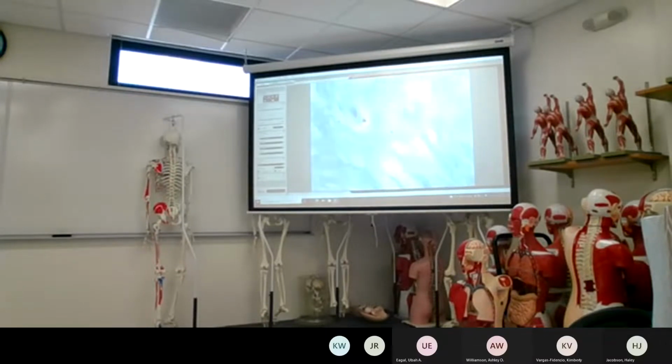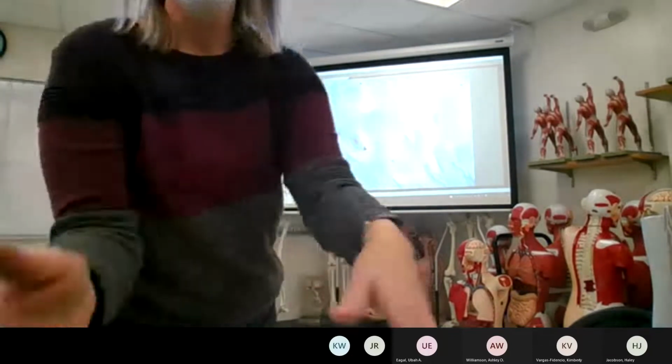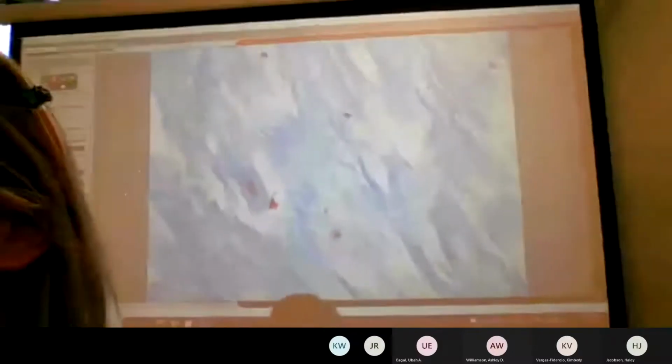My slide looks really damaged, but I'm looking for something that would show you lacunae and chondrocytes. So my slide here, to me, doesn't do a good job of showing cartilage because it's all shredded up.